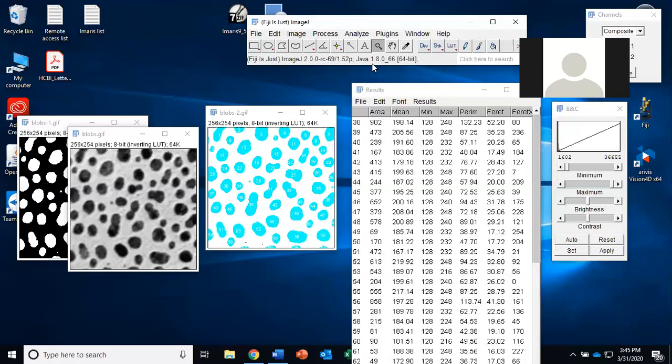Thanks. Just a very quick follow-up question. So how do you feel about the Costes correlation then? Do you think it's an outdated method, or does it reflect pretty well any co-localized patterns that are in similar brightness? Thanks. No problem. Aaron, Chris, feel free to chime in too if you want to say something.